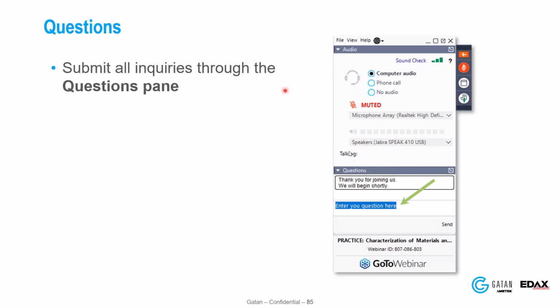The first thing, coming down to the last part, is: is it a polishing problem or is it an indexing problem? Traditionally, when I think about Hough indexing, there are three legs of the stool, for people who were at dinner last night. The first is pattern center calibration. With modern software systems, that's all set up and stored, so you don't have to worry too much about it, but that's a value used to measure the angles and define the geometry of the system. So that has to be right for indexing to work.